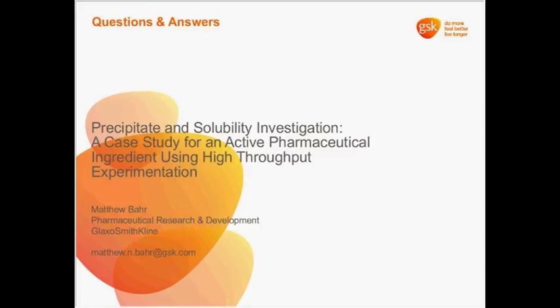So, Matthew, on slide 9, you mentioned that the drug chelates, and you showed a picture of the rust color in the vials. Did the solubility data for these look different than for experiments that you've run with the Teflon coated stir bars?